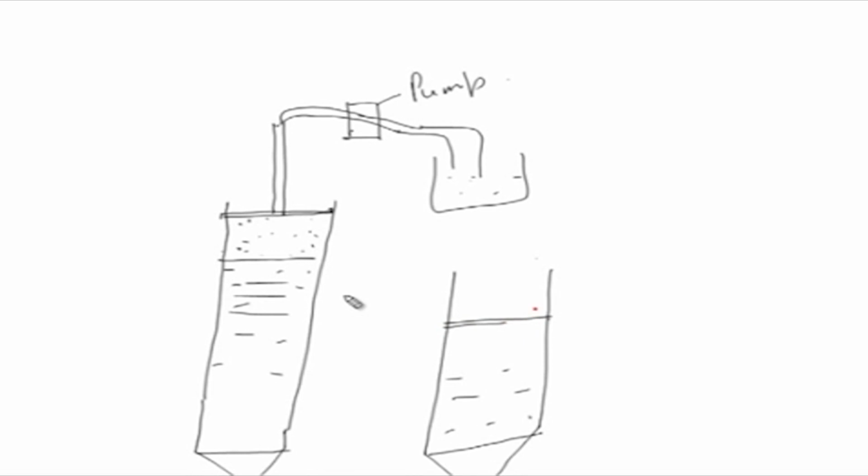Then, with a micro syringe or a pipette, you can load the sample in a smaller volume, and very slowly let the sample get into the column. Once it gets into the stationary phase, you put the mobile phase back, put the plunger on and start the chromatographic procedure.